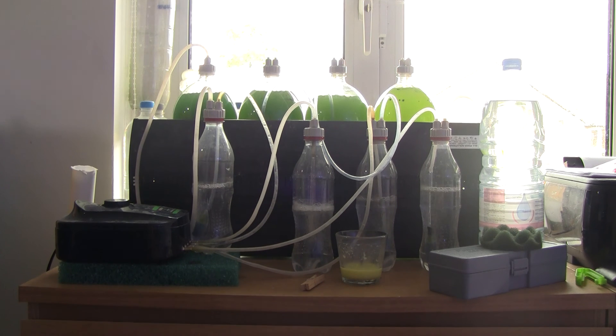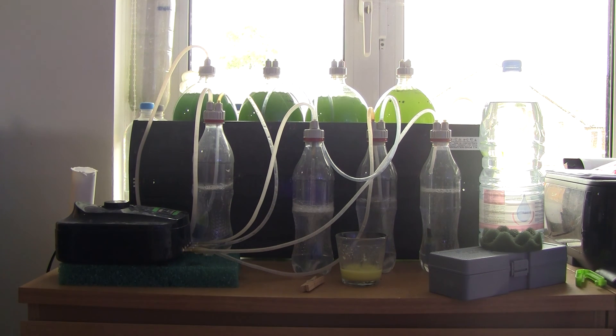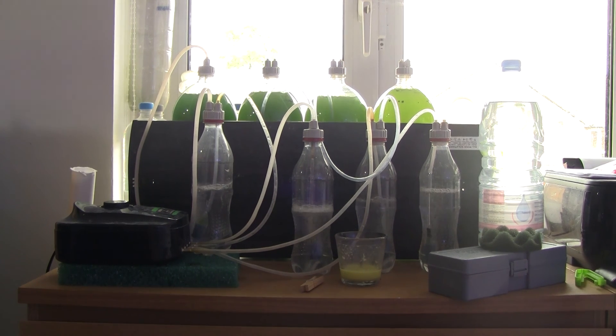I know that there are a lot of plankton videos online, and well, this is just another one. I just thought I'd go into some details that I haven't seen on most of these videos — actually, I haven't seen on any of these videos. First of all, a description of my setup.